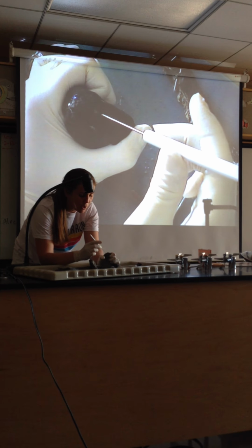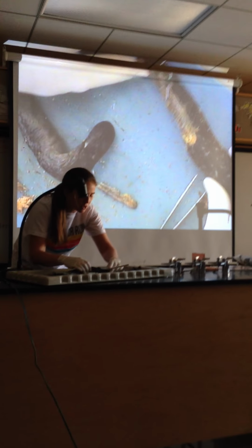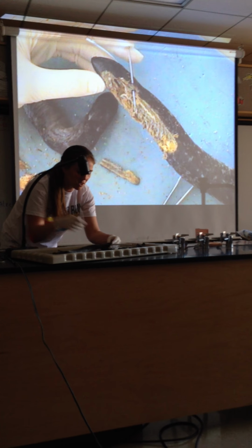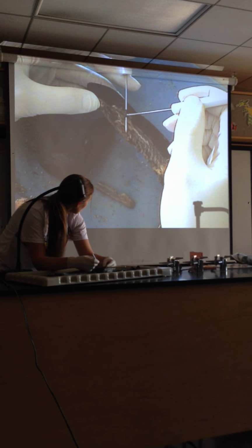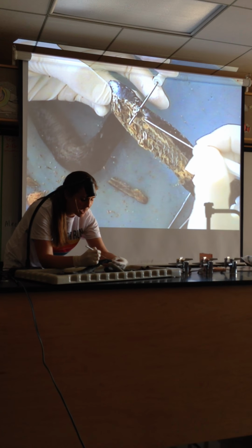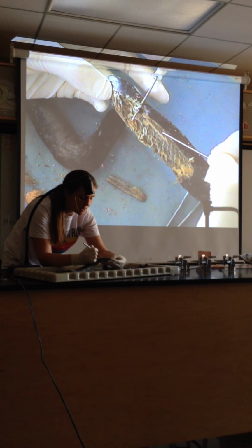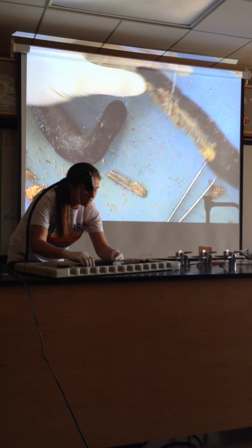When you insert the probe into the medial nostril, it goes through a tube, and that tube then leads to this particular portion, and you can see where the probe has gone in through the medial nostril. It's coming out this particular structure right here, and that's the olfactory sac. Just behind the olfactory sac, you're going to notice the brain, and you'll see the spinal cord and the notochord in a little bit, but this is the beginning of it.